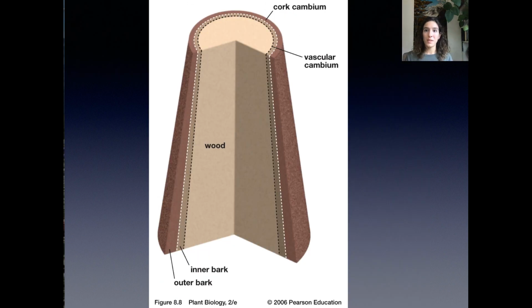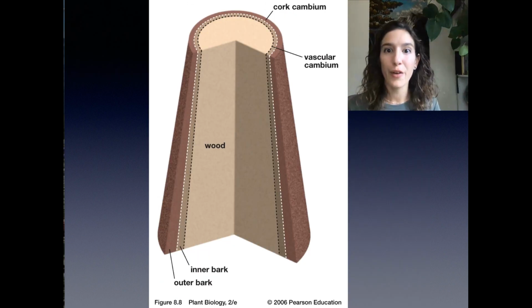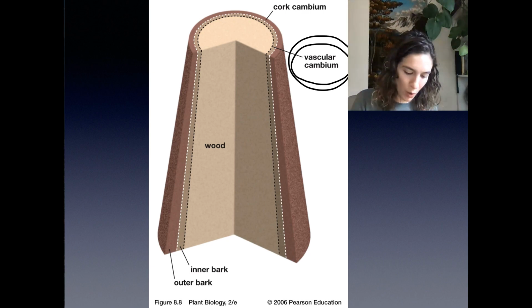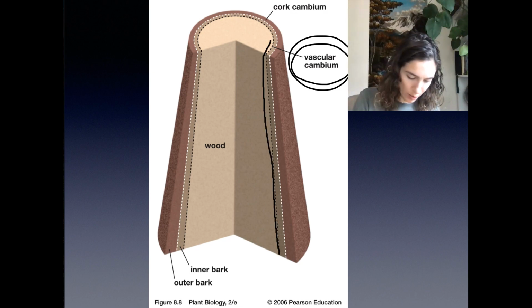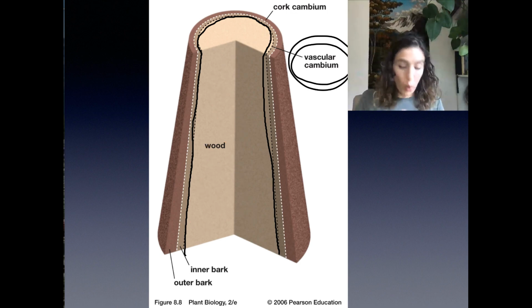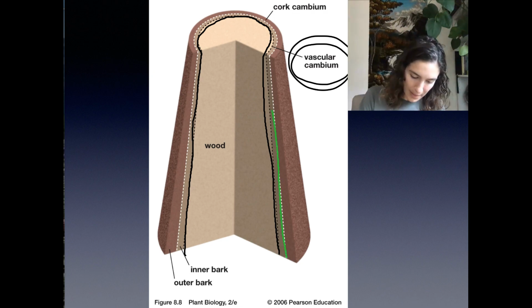So the periderms are actually coming from another cambium. What? Yes, we've been talking about the vascular cambium this whole time so far. And that would be represented by this line in this sort of fancy cutout view of a diagram of a piece of wood. And that means, again, everything inside here is secondary xylem. Well, our cortex was pushed out, and it formed this new layer of cells called cork cambium. It's outside of the vascular cambium.